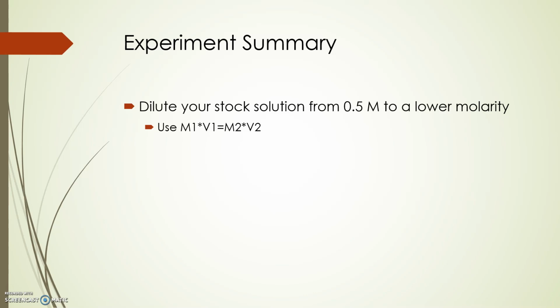When making a dilution, you generally are trying to calculate V1, the volume you will transfer. You have a target concentration and you have a specific final volume you will be making. When you have made your dilution, you can use the equation to calculate the actual molarity of the dilute solution that you have made by using the actual volume you transferred.